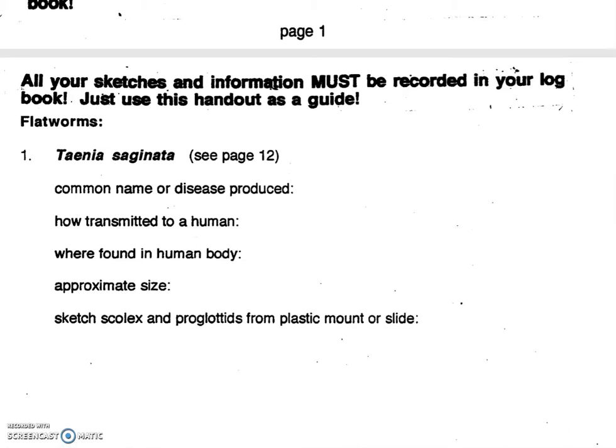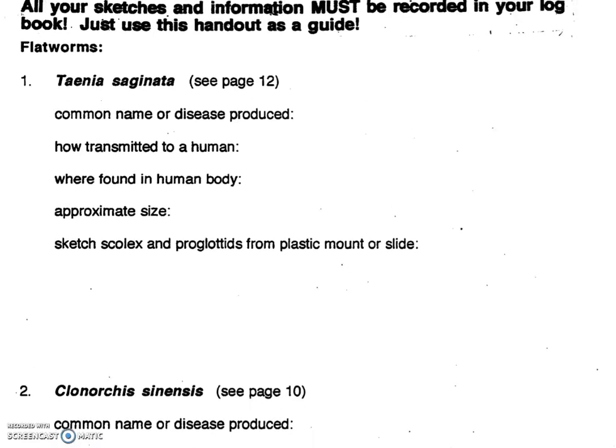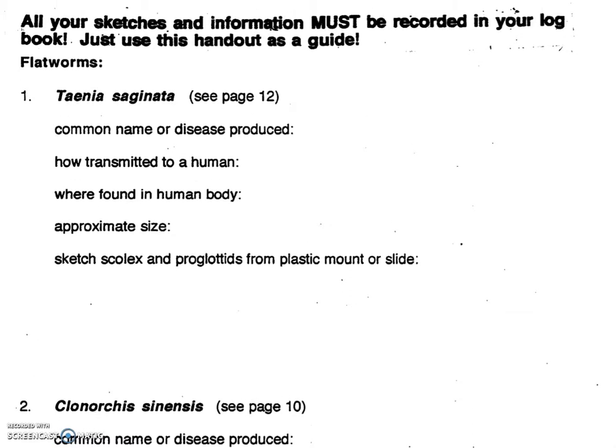This one is a beef tapeworm that you might end up getting if you're eating undercooked beef that was infected. There's a little story to tell about this one. Some people purposely infected themselves with tapeworms because they wanted to lose weight. You can certainly lose weight doing that, but it also obviously bears some risk and some side effects. There's tons of information on the internet, including pictures, and you should make your own drawing.